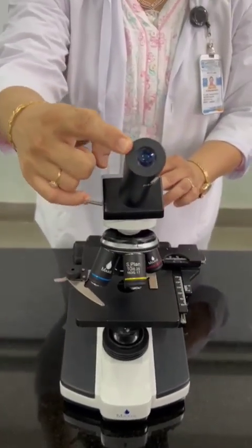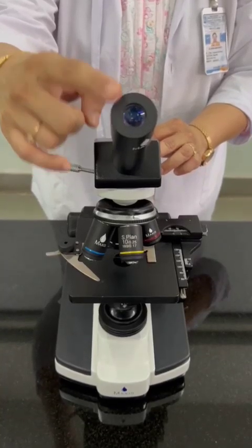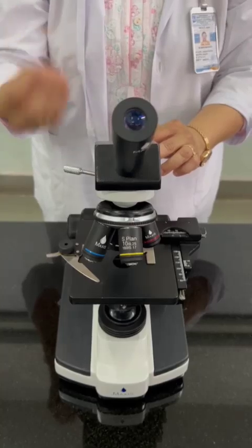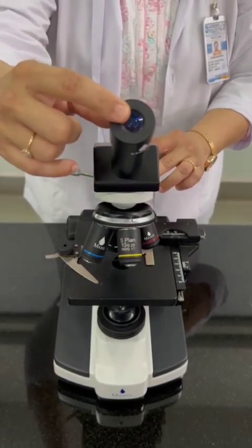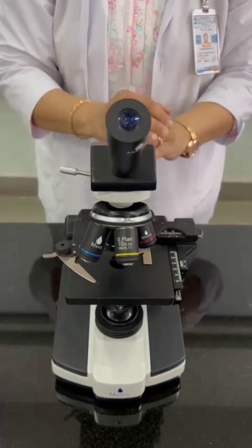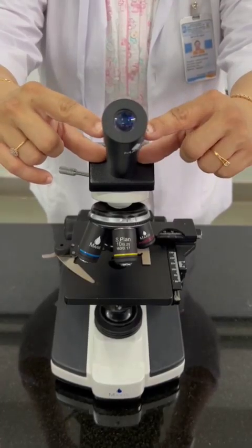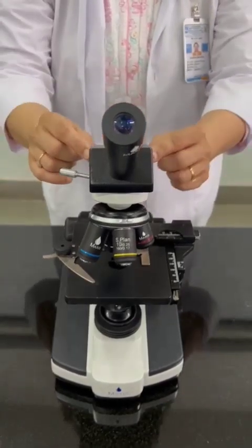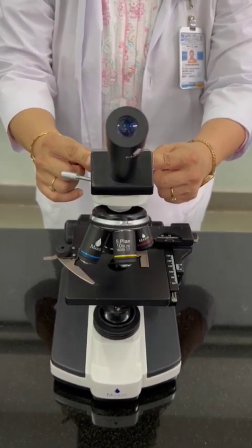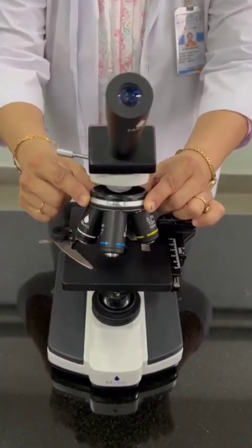This is the eyepiece. As the name suggests, from here we will be able to see a magnified image of the small object that is placed under the microscope. Now this eyepiece forms a virtual image of the object which is seen by the eye. This part is the body tube. This body tube, according to the manufacturer, is 160 millimeters, the actual length being 142 and the length of the revolving nose piece being 18 millimeters.